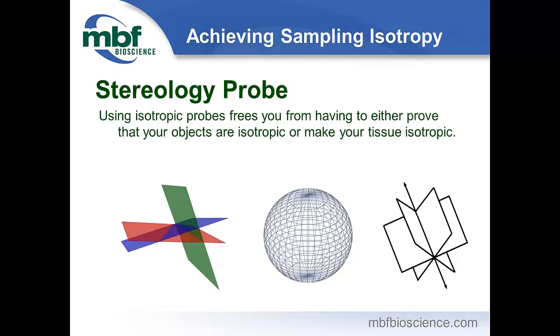Okay, we have a question from someone who asks, can these techniques be used for lung stereology? We are actually going to take each feature, the number, length, surface, and volume, and go through them one by one. Certainly you can use these stereology probes on any organ.